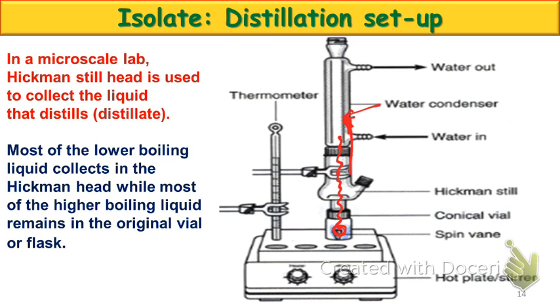And if it dripped back down into the reaction, would we ever collect it? No. So what has to happen? We put a Hickman distillation head. That little distillation head has a little lip on it. Your liquid is going to collect right at the base of that. Your job is to pipette the liquid out through that side port before it drips back down into the reaction. Okay?